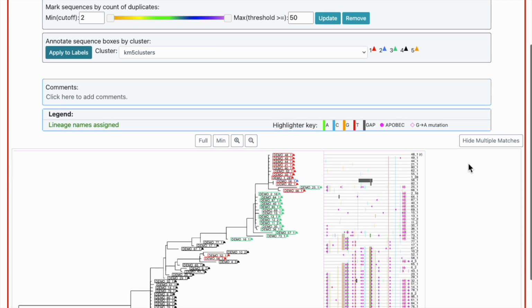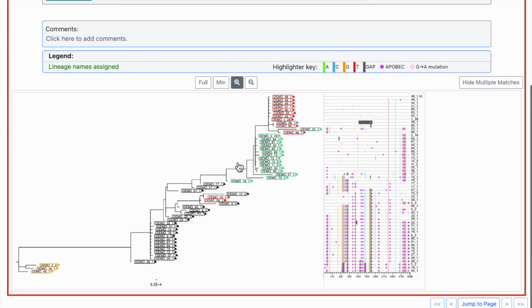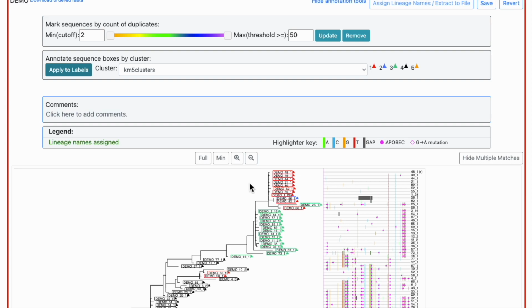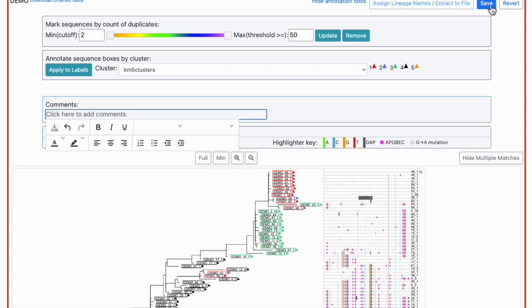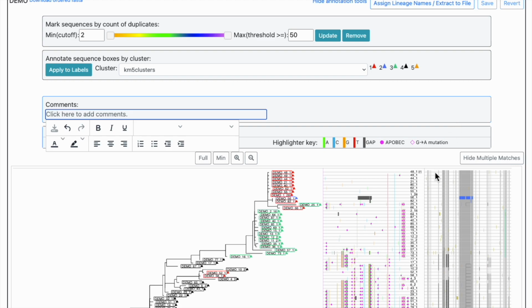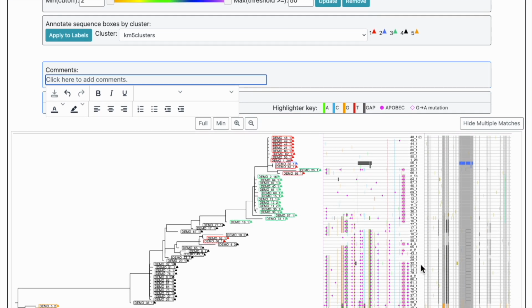Another thing you might have noticed is that around the outside of this data set, there's now a red bar. That red bar indicates that changes that I have made have not yet been saved. So I'm going to hit the save button, and that's going to save this data into PhyloBook's data system. The other thing you'll notice is that now, in addition to having this plot, we have a new plot that showed up. So let me discuss these two plots.